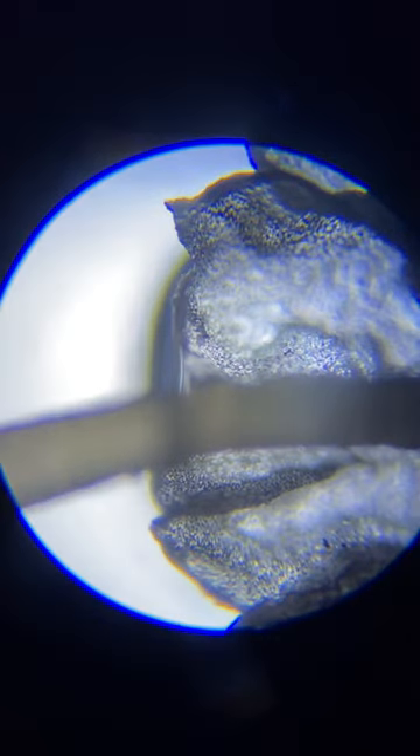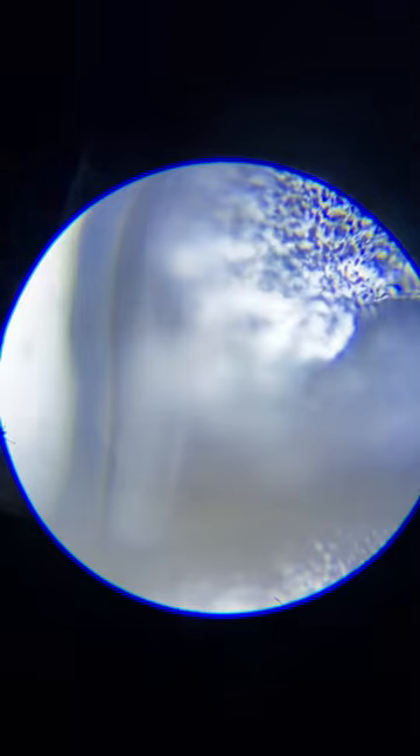Going up and down a little bit — here's the other end of it. There's the stem. I'm going to go to 100x magnification now.